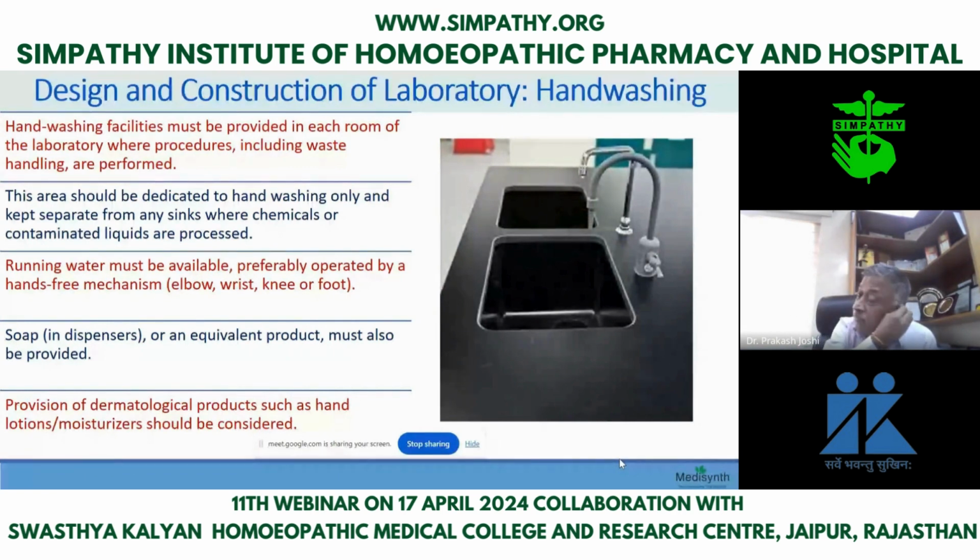When we say water, if you see the pharmacopoeia, they categorize water into potable water, purified water, and water for injection. What we get from our municipal corporation is potable water, which is rich in chlorine, which is good. From a microbial point of view, it is very good because it has a lot of chlorine, so it does not have bacteria. But if you want to do testing of any chemical, then you need to have purified water.